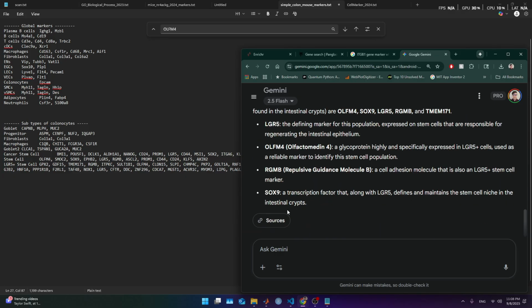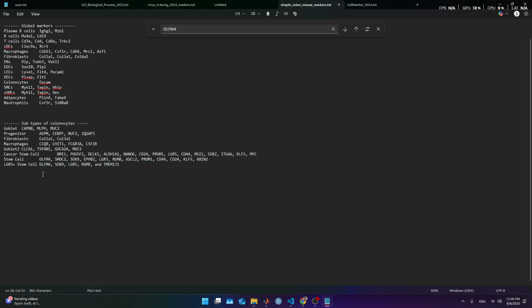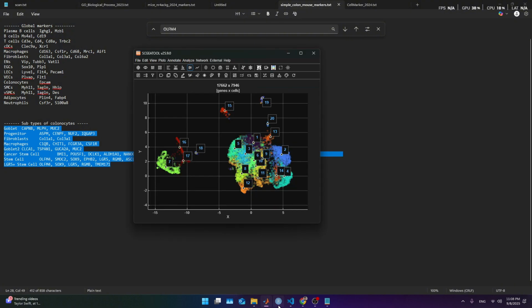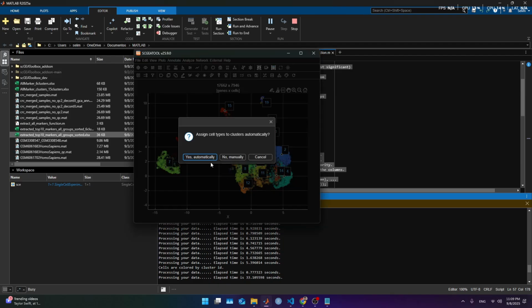And now about LGR5. So just these three markers. Well, and TMEM. Just in case, we're gonna try to annotate that. I don't think it's good because we have already stem cell and that requires LGR5. And let's do again the annotation, once again with this refined gene marker set. So we go annotate, customize, no, and then do it automatically.